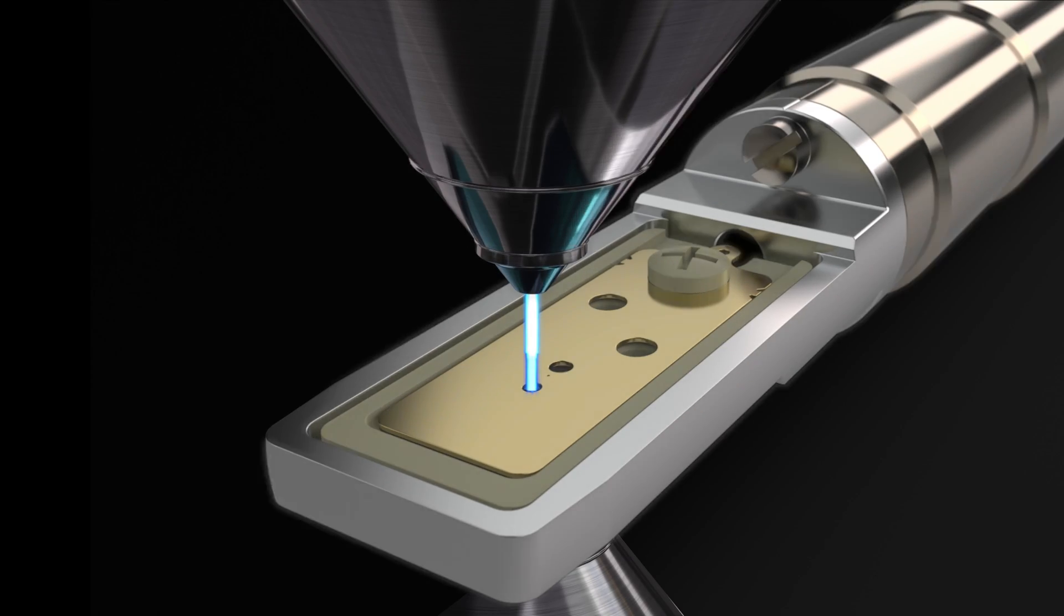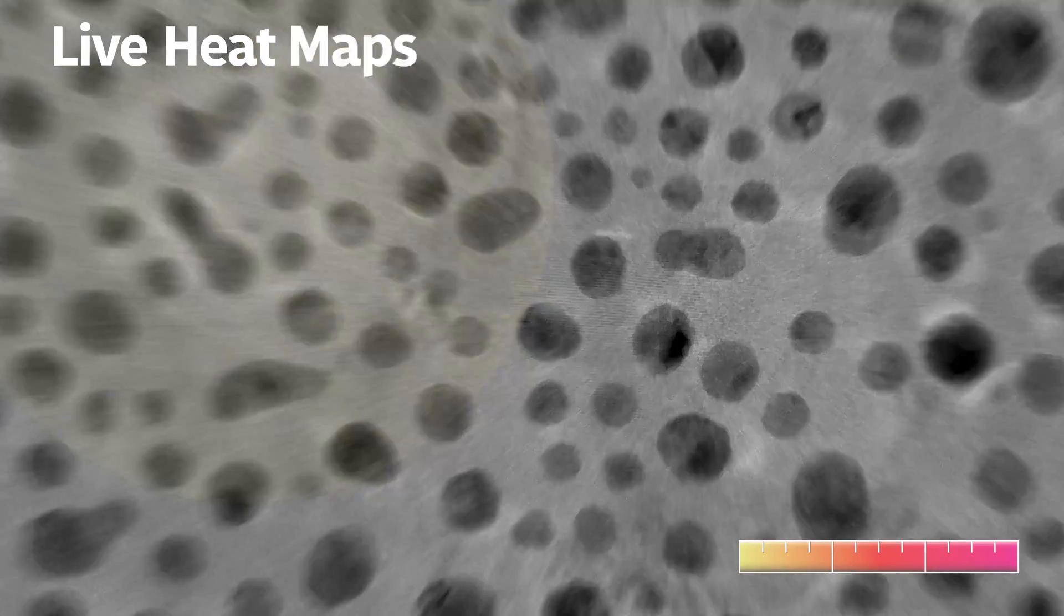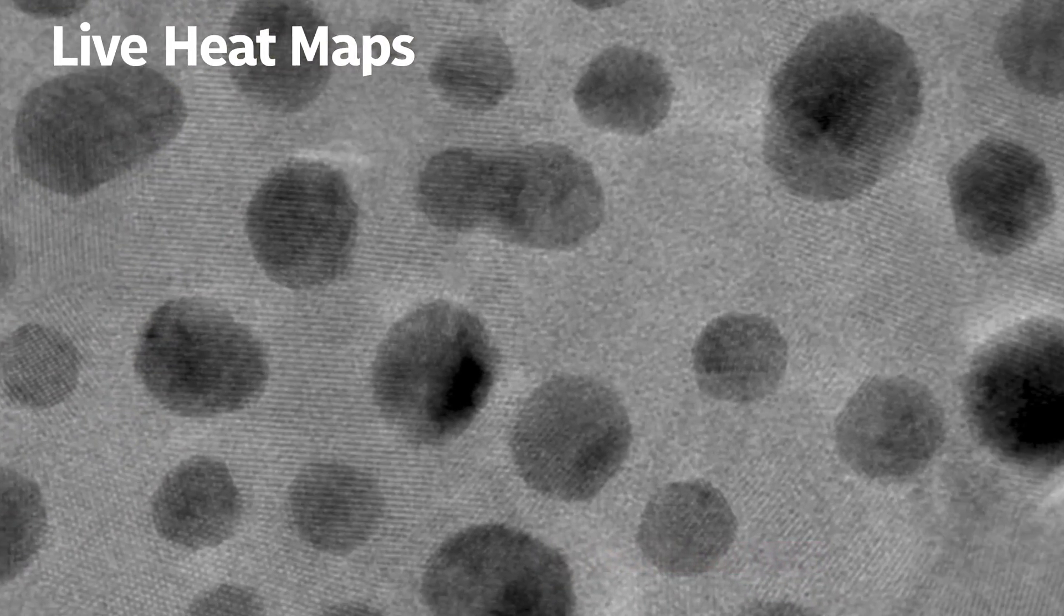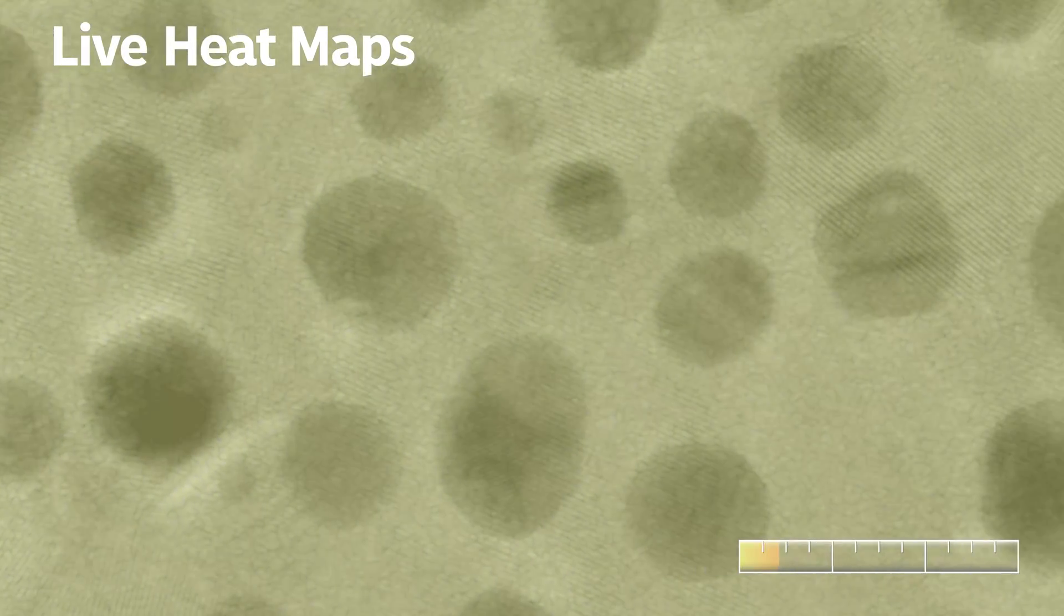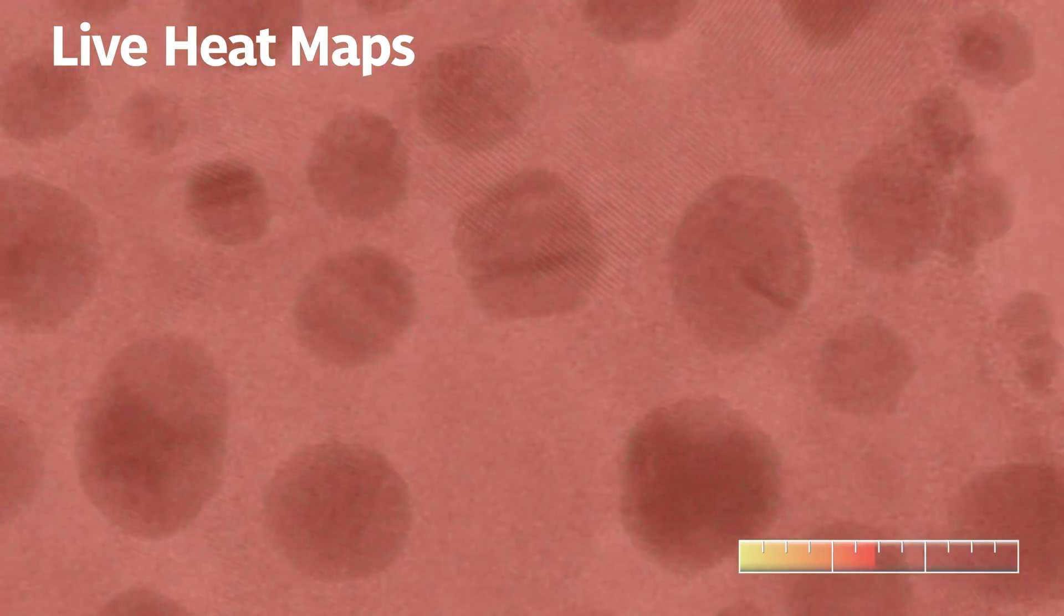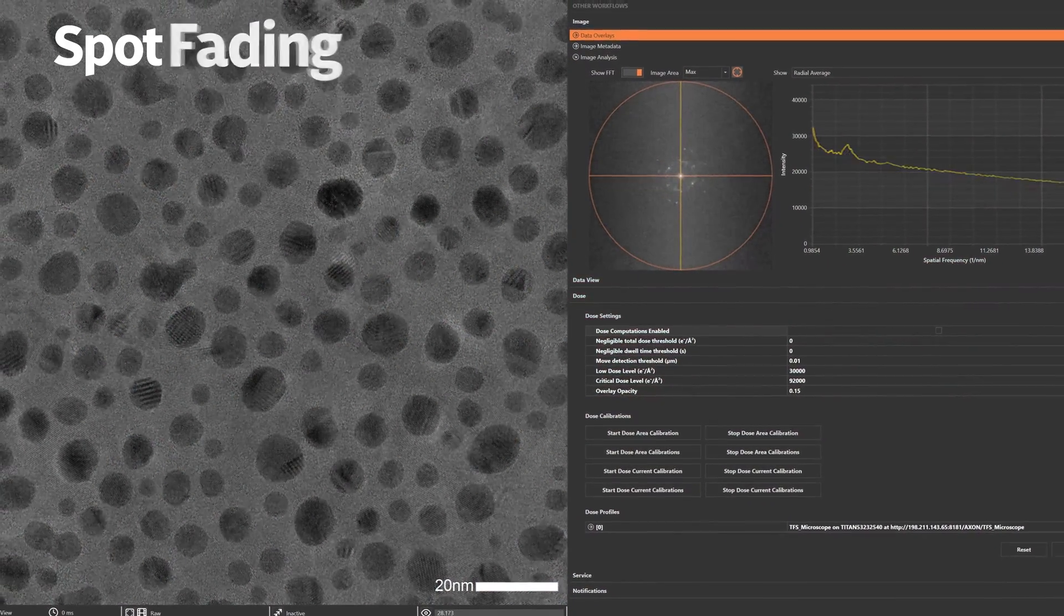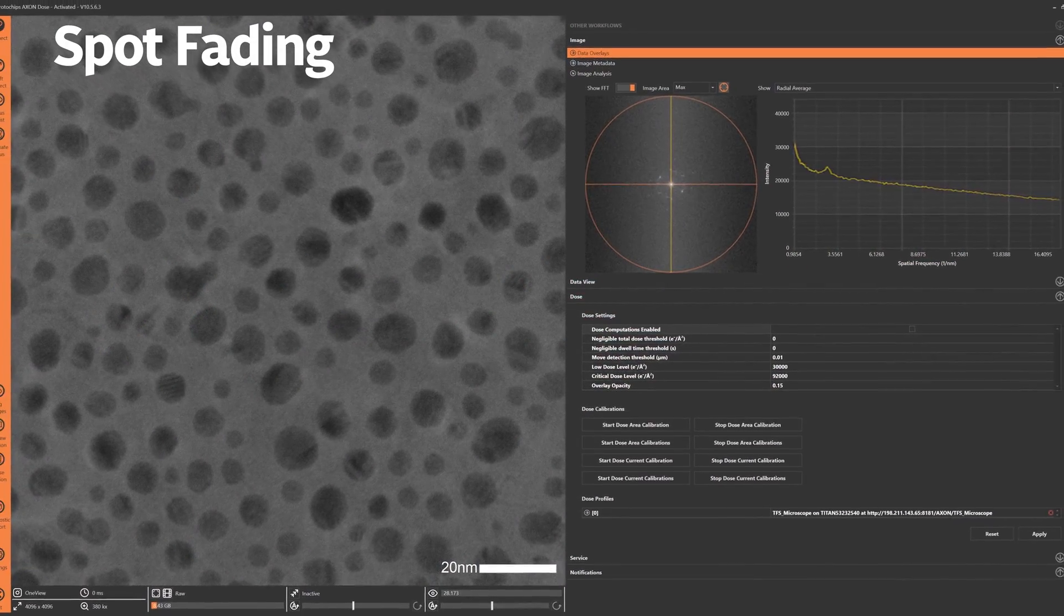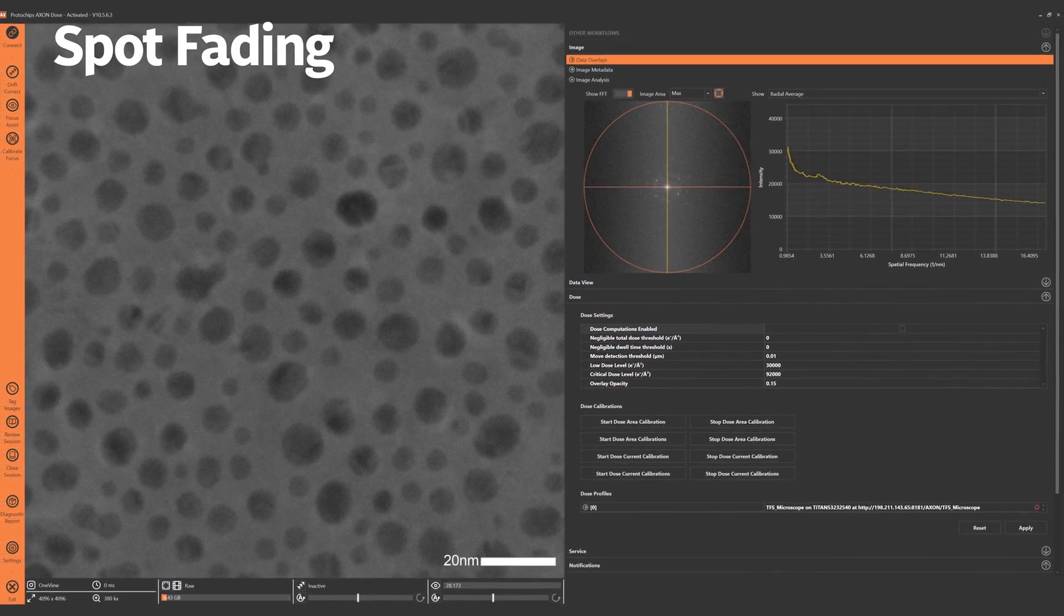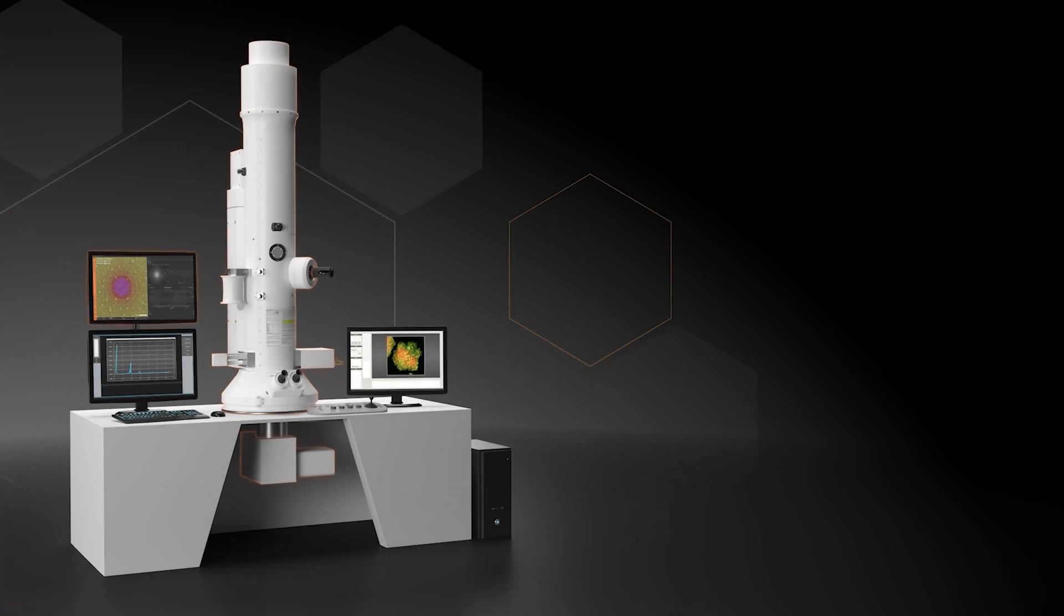Powerful tools like live heat maps constantly updating while you image, user-defined dose limits, and spot fading for analyzing sample degradation. Dose can now be managed like never before to facilitate analysis.